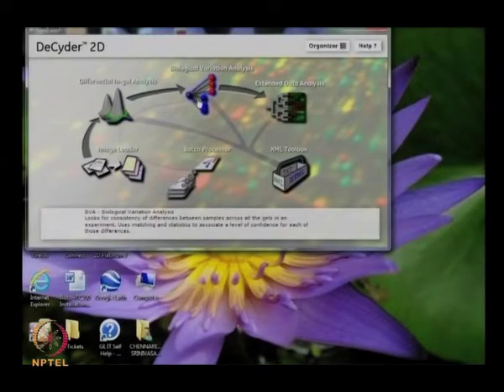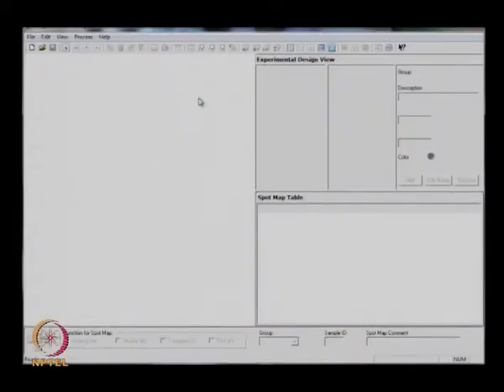This is the BVA. BVA is nothing but biological variation analysis. One of the internal standard images is selected as a master image and all internal standard images are matched to this. The standard-to-sample spot ratio for each protein in each sample is then compared, giving t-test values, fold changes, and ANOVA values for each and every protein. How to create a BVA workspace?